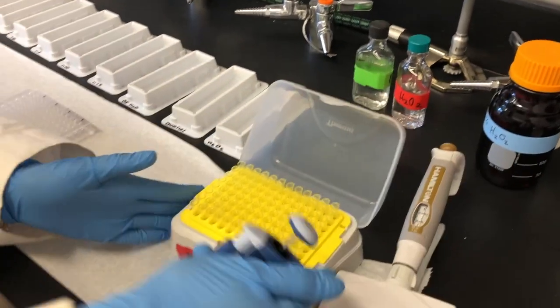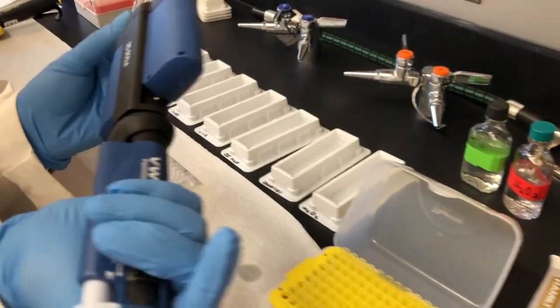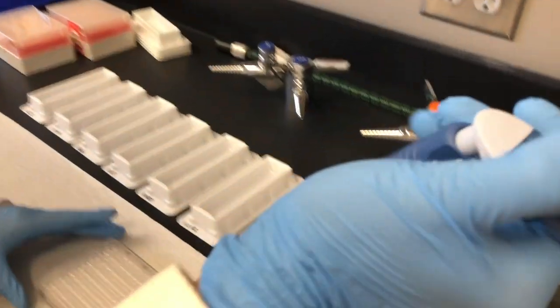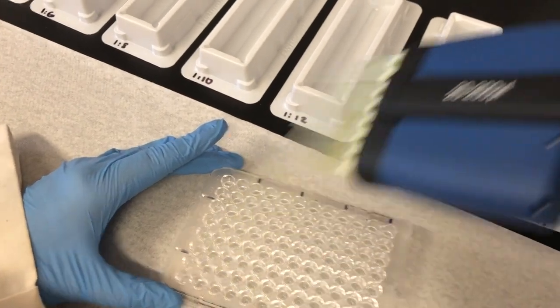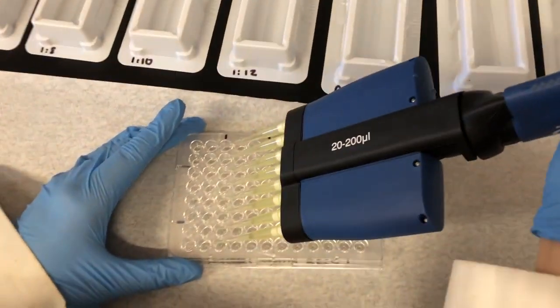With the multi-channel micro pipette set, I am going to put on the tips and make sure they are on tightly. Then I am going to pipette DI water to all the odd columns. The volume across all tips should appear equal.